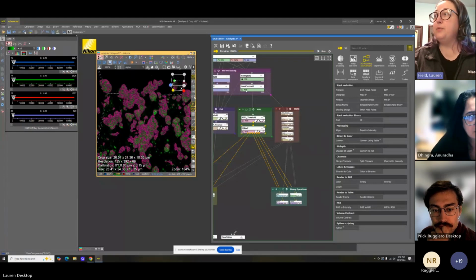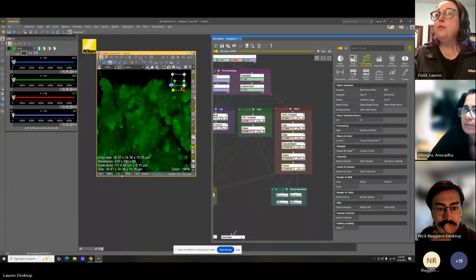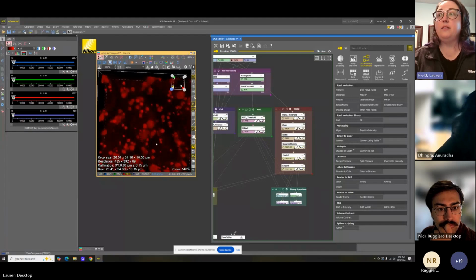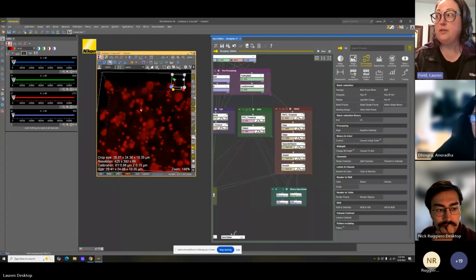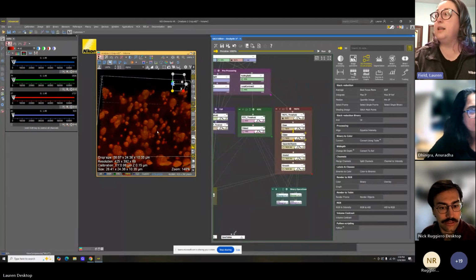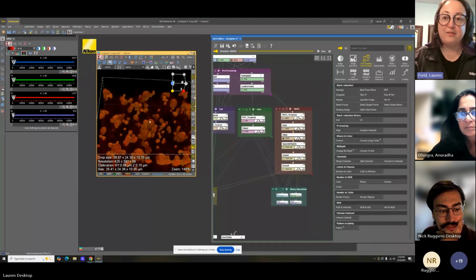The final channel that we played with in here was TRITC. For the TRITC threshold, I think that this has some pretty nice distinct bright versus dark areas. There is maybe a little bit of background, but a traditional threshold should be able to handle this pretty easily. I ran a threshold and then also did some processing on that image just to try and get, again, a kind of easily viewable version of the binary over the red channel.